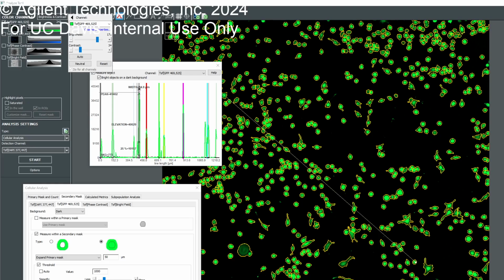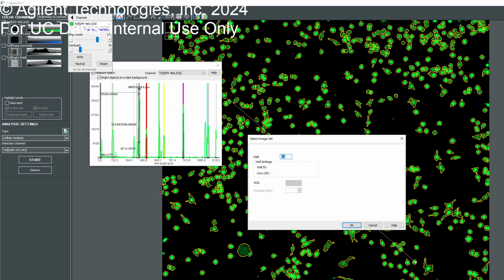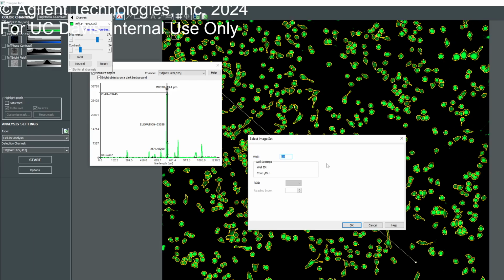We have to collect some images first to get an assessment of what works and what not. Oh, we have images, right? Yeah, we can add actually. Yeah, click OK. Maybe add a couple more image sets. And then add whatever you think would make sense. It's pretty good. Okay, so if this works, let's do one more.